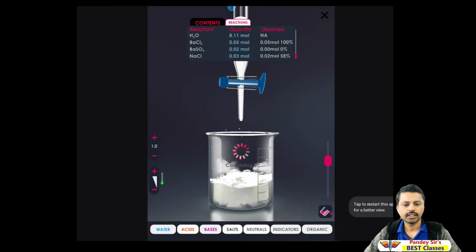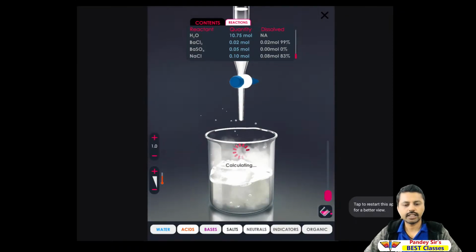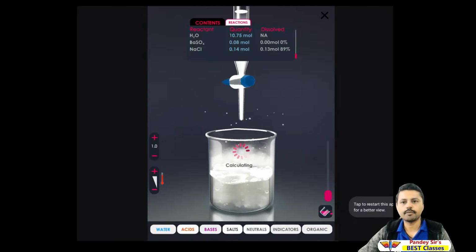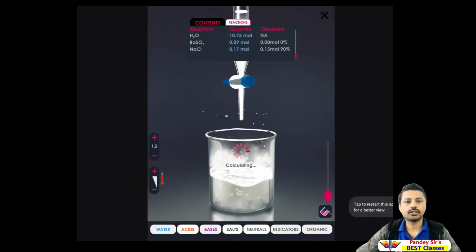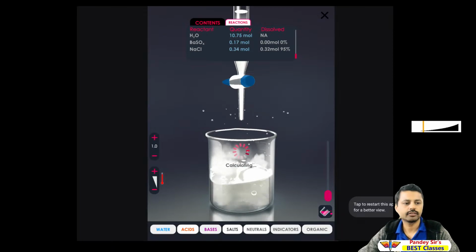Hey, it's forming a white precipitate. Wow, it's nice. It was worth it. Okay, so the reaction happened and the temperature is increasing, so it's an exothermic reaction. Now let's find out what the actual reaction will be. So sodium sulfate will be Na. It's quite dark, very dark.